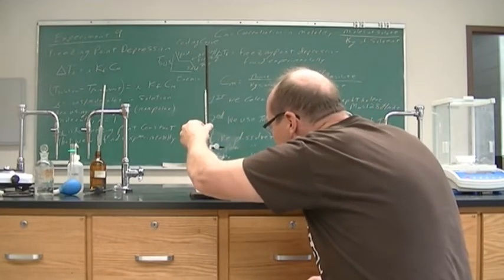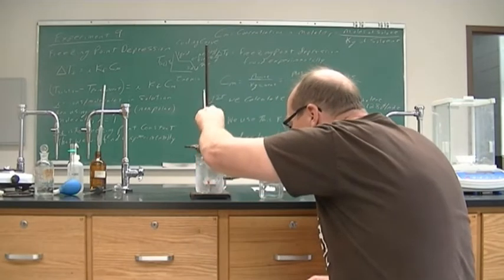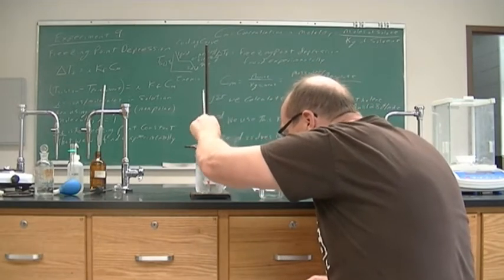Okay, now it's at 3.8, but still no solid forming.